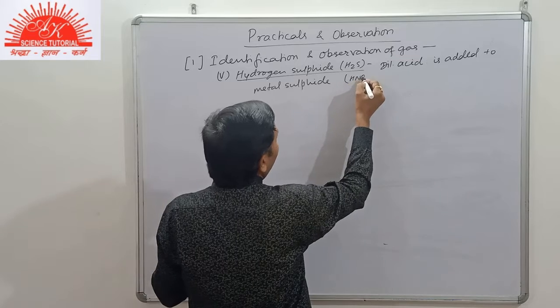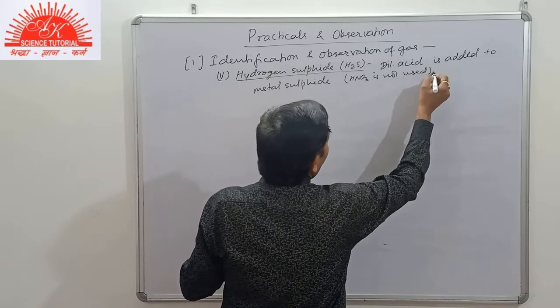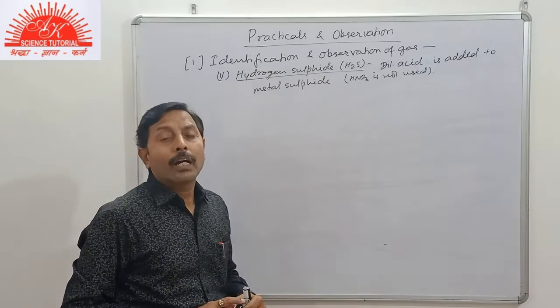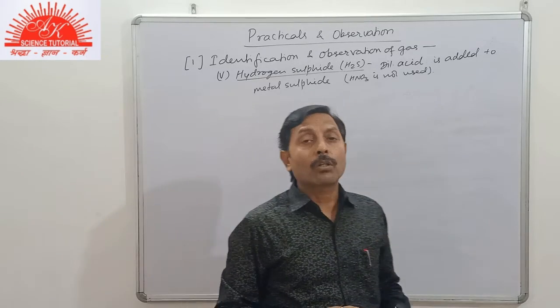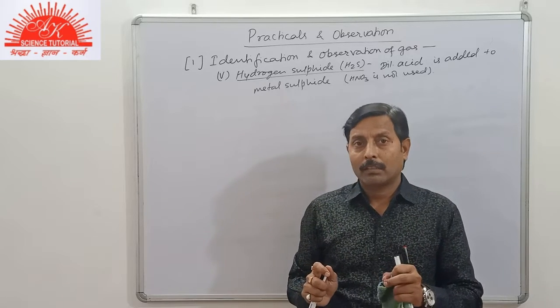Here HNO3 is not used. Nitric acid is not used due to its strong oxidizing nature.